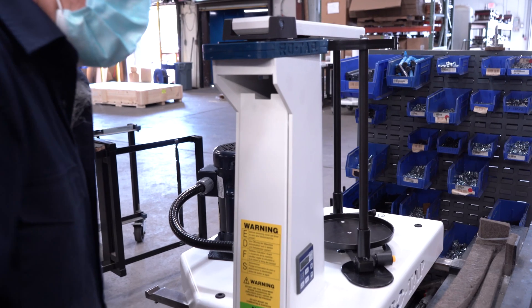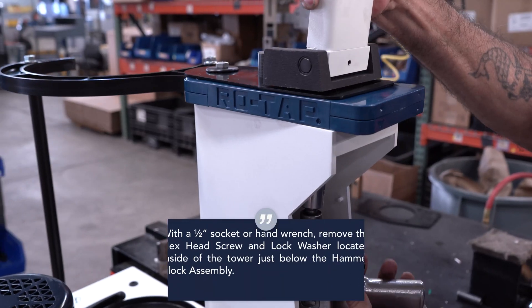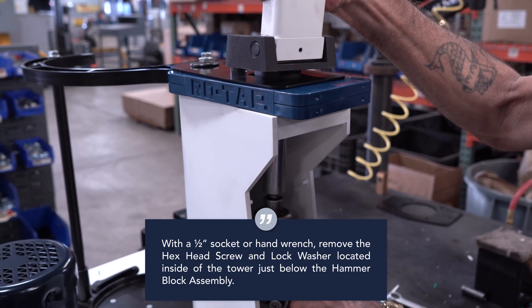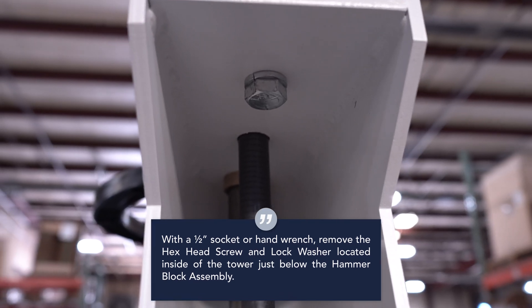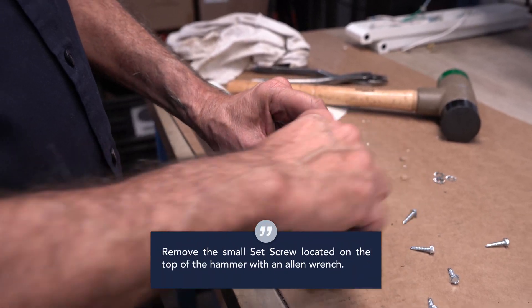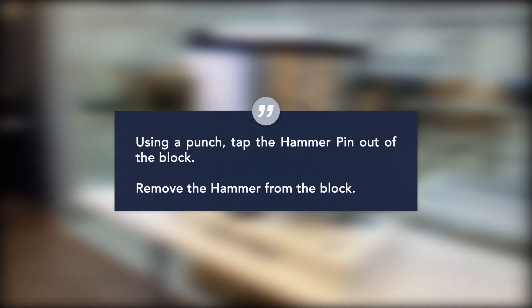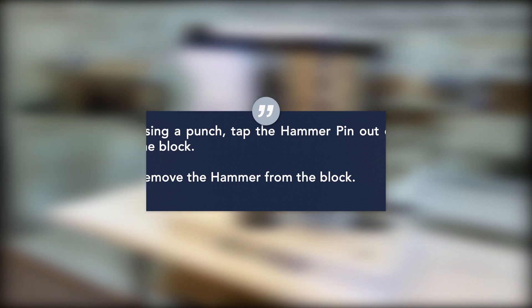Replacing the hammer block: Remove the pedestal cover. With a half-inch socket or hand wrench, remove the hex head screw and lock washer located inside of the tower just below the hammer block assembly. Remove the small set screw located at the top of the hammer with an allen wrench. Using a punch, tap the hammer pin out of the block, then remove the hammer from the block.